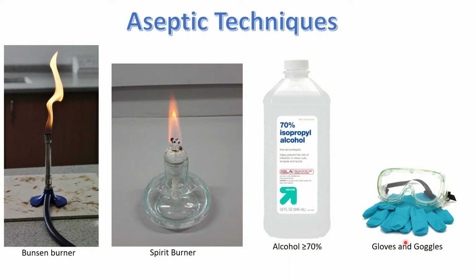Okay, so we're looking at bacterial growth. So we probably know that we need to use a petri dish. So this is the technique on how to test if the plant substance has antimicrobial properties. So basically, can it stop bacterial growth?